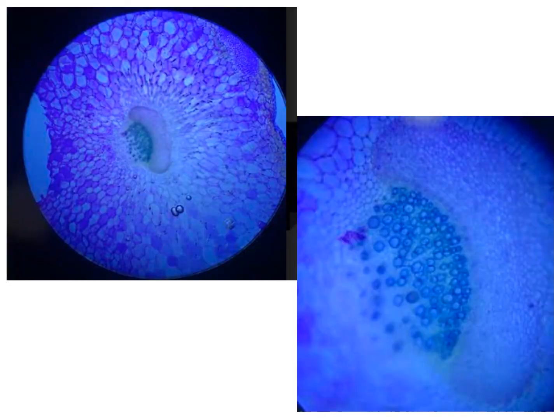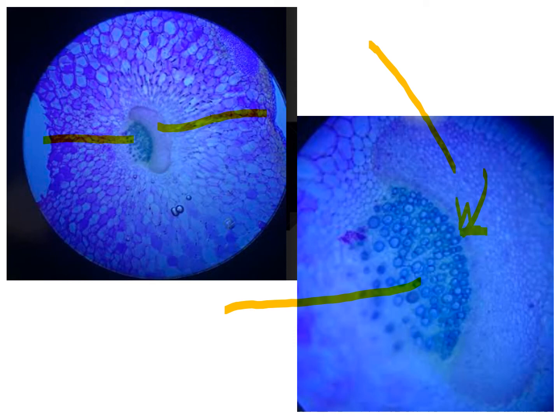And so these were some of the others. So you can see on low power here, you've got the xylem there. That would be the sclerenchyma. It's difficult to see the phloem. You can see the xylem there very, very nicely. Depending on the colour, that is probably sclerenchyma, and that, in there, is probably the phloem. Maybe a little bit of this round here is phloem. It's difficult to tell. Yeah, I'd have to see it on the actual slide. But that's the kind of thing that you're going to get.